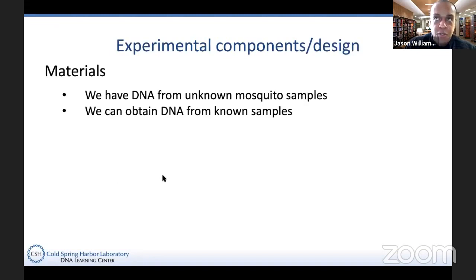The other thing that's really key when we're talking about bioinformatics is that I want people to really understand and appreciate, because it's sometimes difficult, that we are actually talking about experimental design, and this is going to be a goal for today. We are doing an experiment. Sometimes folks feel that when they are just messing around with code or working with data, it's not an experiment.